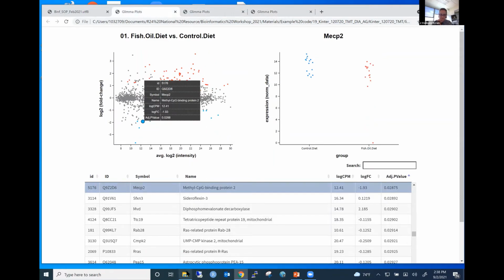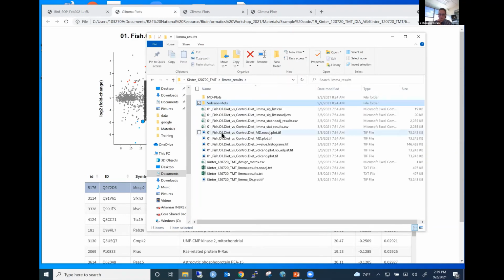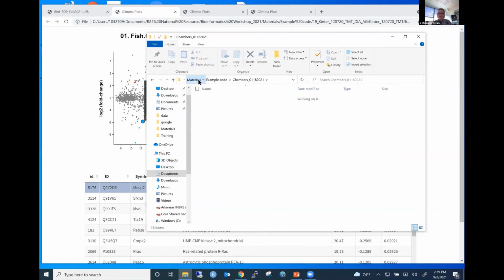Alrighty, so all of those results would be sent to the end user. We do try to make, and I don't think I have it in that one. I think I made it in this other example. Let me look at it. And it may be actually in this one. Like I said, I got a lot of stuff.